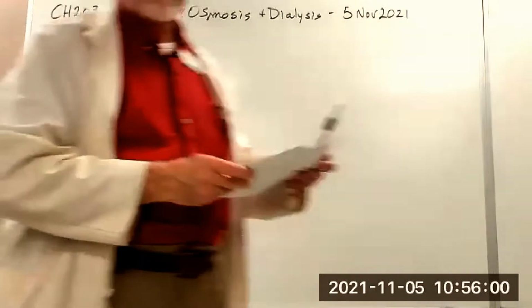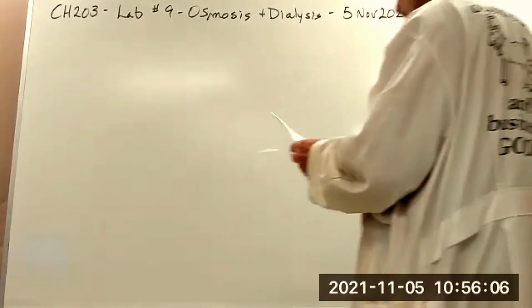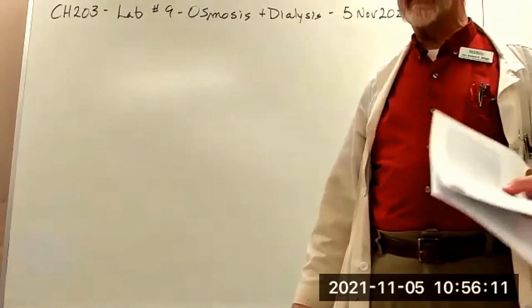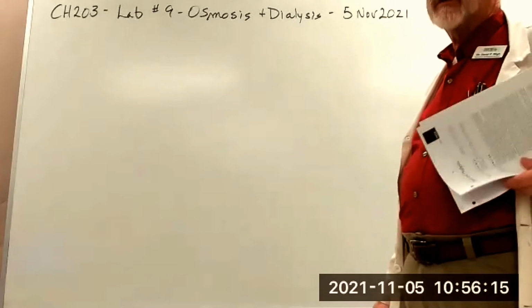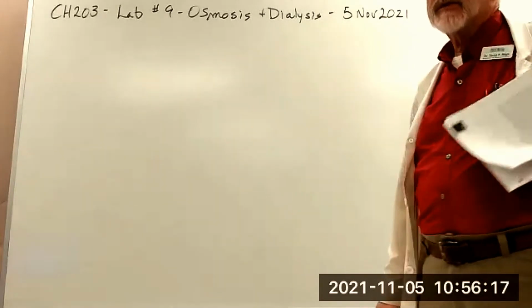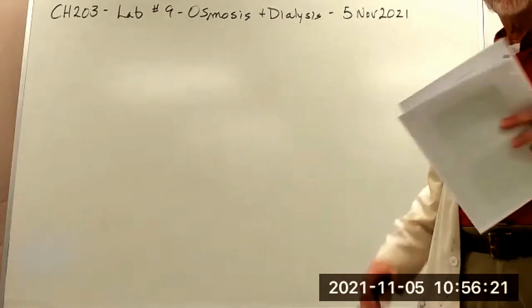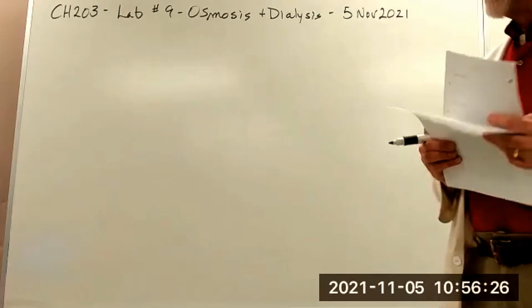Okay. So this lab is on the topic of osmosis and dialysis. We have a definite concept of what osmosis is based on what we studied so far. Dialysis is sort of a subset of osmosis.